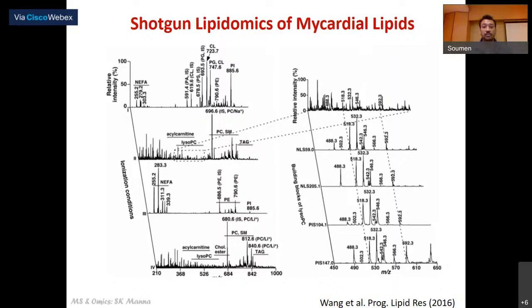However, that is very time consuming. So therefore, people have come up with this idea of shotgun lipidomics, and a similar approach is also useful in proteomics. The reason this is so widely applicable in lipidomics and proteomics is that the fragmentation pattern in lipids, and in the case of proteins, therefore peptides, is relatively simpler or streamlined, I should say. It is something that you can theoretically predict.